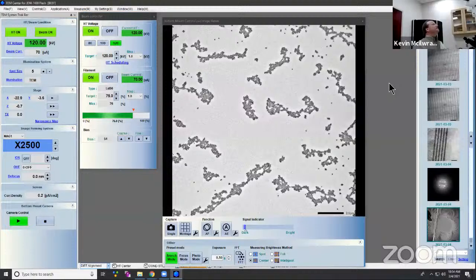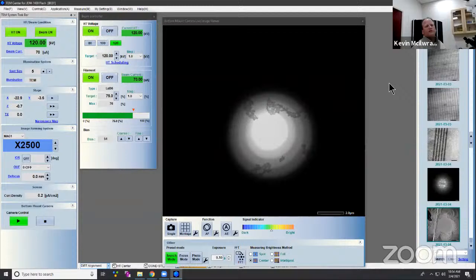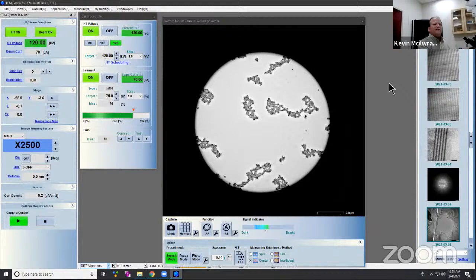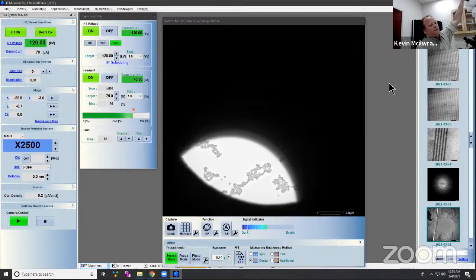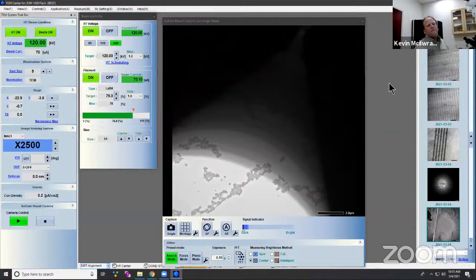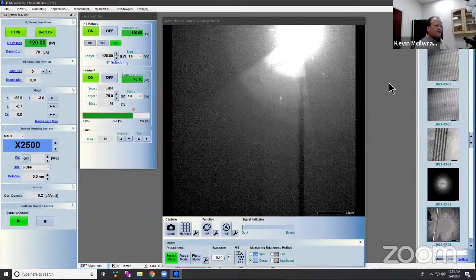So now if I am aligning my illumination, let's say I come down here, my illumination basically comes straight in and out. Now, if I misalign my aperture, even though my illumination looks centered, let me misalign it a lot. There we go. Okay, this will be really bad. See, the illumination swings. Now, that's not normal. So we actually go to crossover. We bring the illumination back to center.